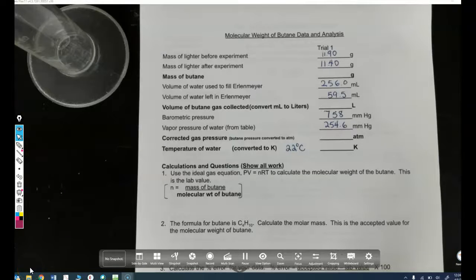Okay, so at the end of this laboratory, what you see here is the data that we have collected, and you have the appropriate conversions and pressures and temperatures and volumes and masses that still need to be worked with so that you can do the calculations. Please come to tutorials if there are any questions that you have, or catch me at the beginning of our next class.